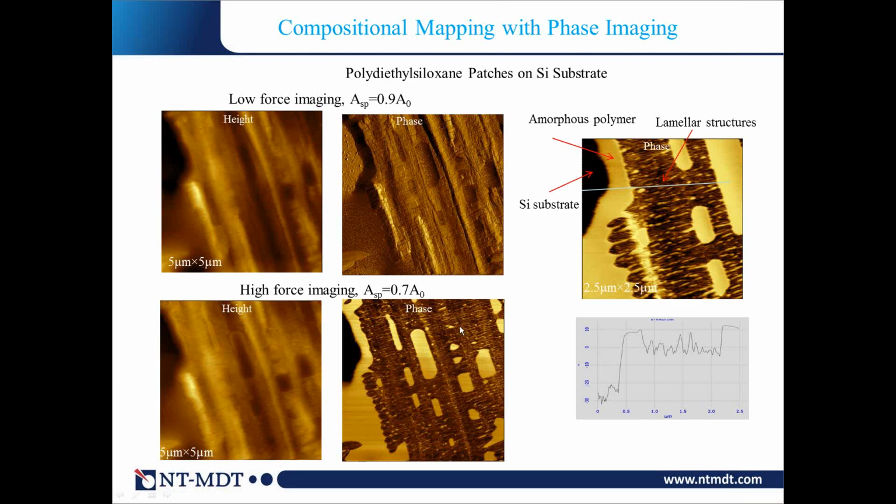In the instruments I worked with in the past, the Digital Instruments, now Bruker, they have a different contrast variation, because the phase is used differently during the tuning. In one case, it goes through zero from high to low numbers, in another case, vice versa. But this doesn't matter. With the phase, the problem is that you cannot understand it.